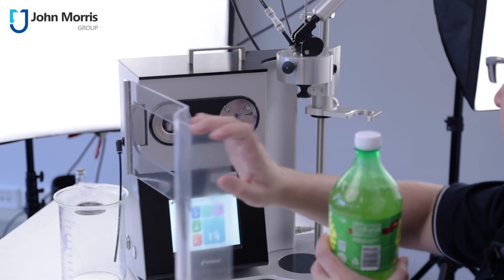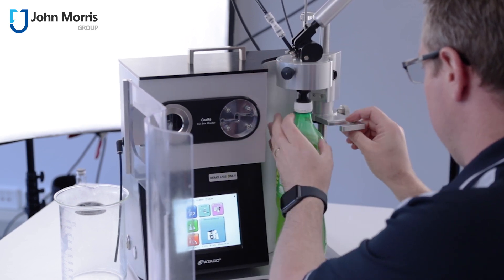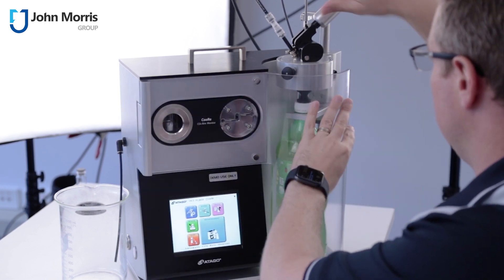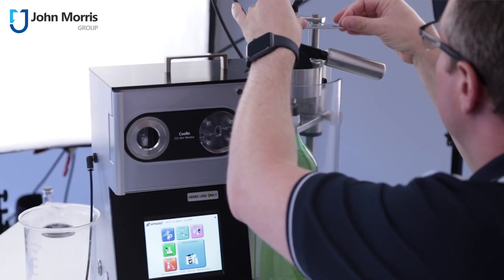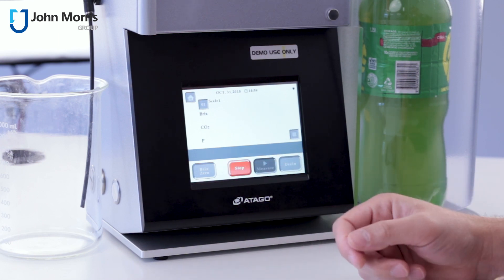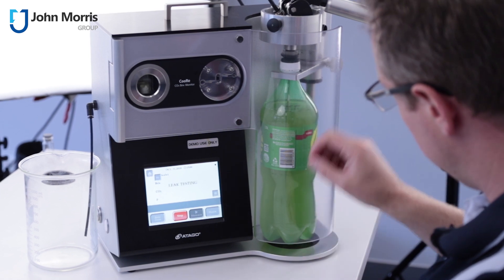So trying not to show labels, let's load it. There we go. The first thing to do is to do a leak test and you can see it's applying pressure into the bottle — see all the bubbles have disappeared.